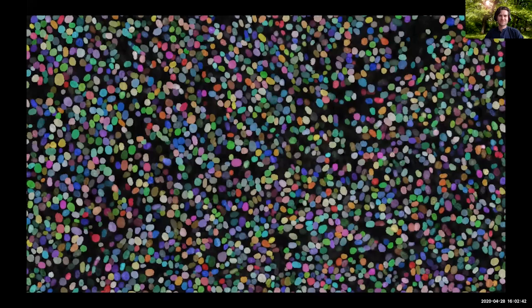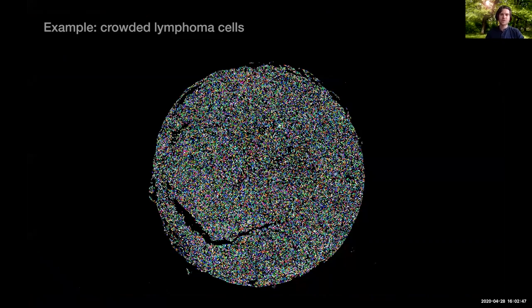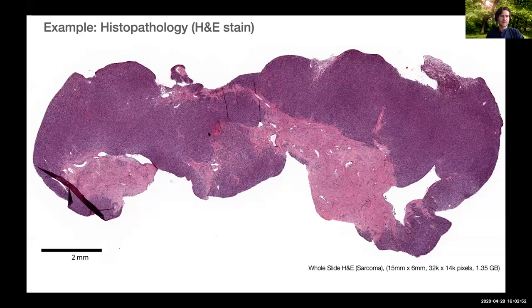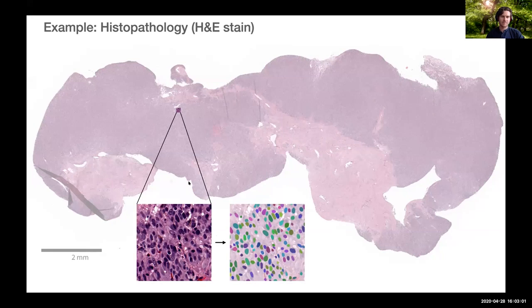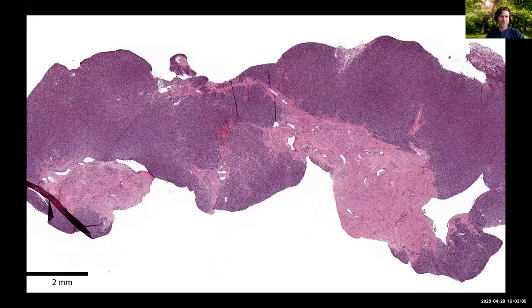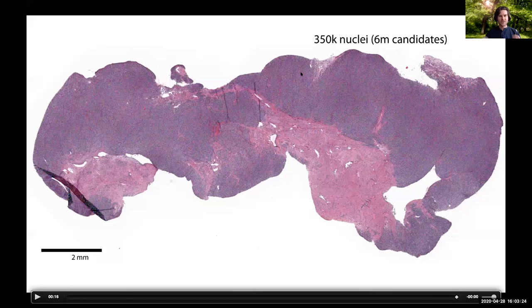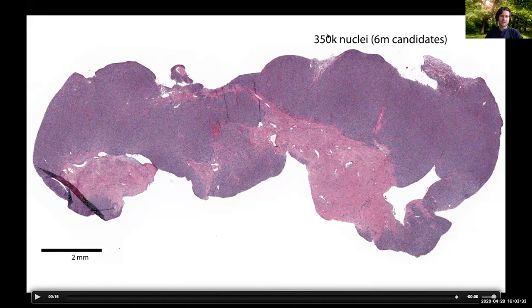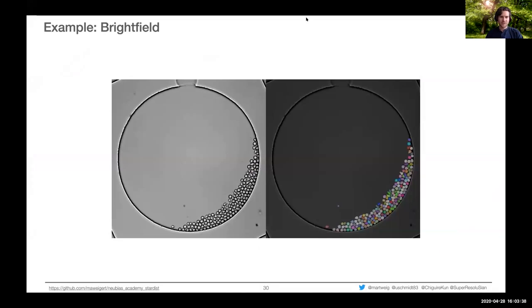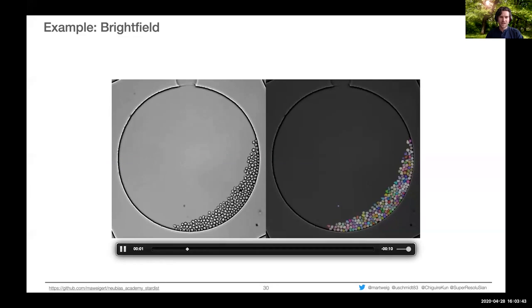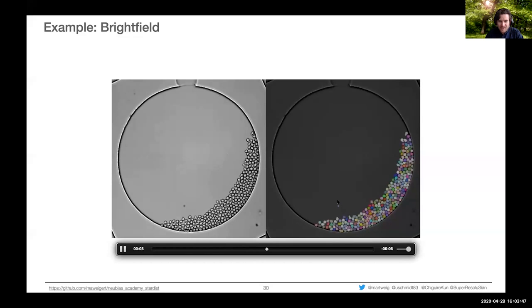On a large example of 20,000 lymphoma cells, StarDist correctly delineates most cells. On H&E histopathology whole slides with a different modality, it also works well, segmenting nuclei across large images. On bright field stem cell images, it successfully segments cells at each time point, enabling analysis over time.